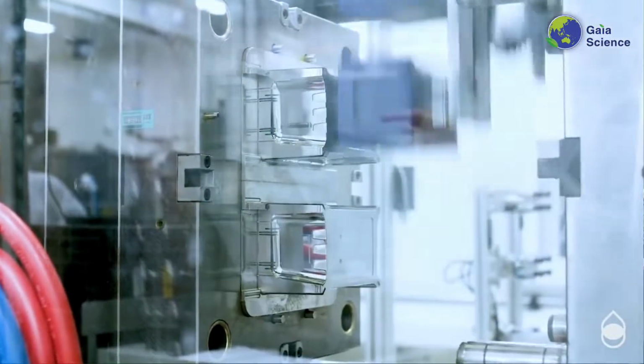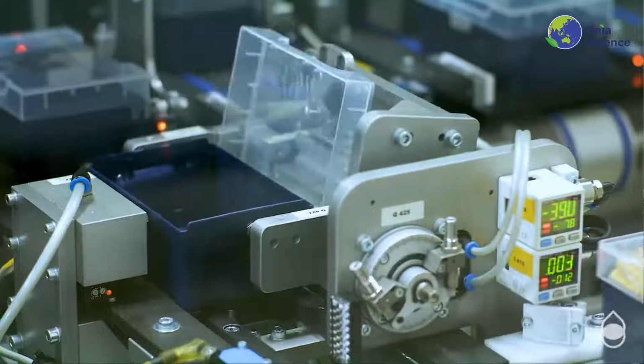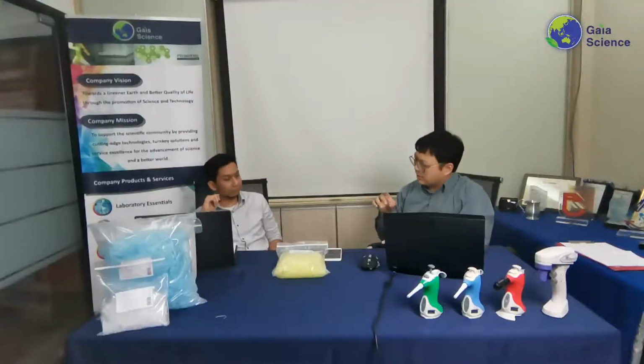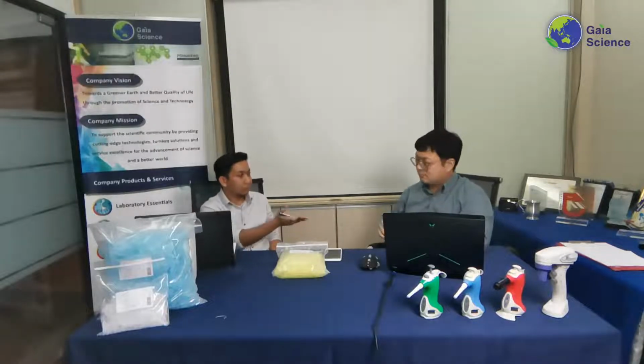Well, I would say that buying bulk doesn't really compromise the quality, because whether it is bulk or rack, the manufacturers manufacture all of them equally. It's just that one is packed in bulk like this, and one is packed in racks. And it leads to another good question, whether it is sterile or not sterile. Out there, they also have bulk and rack, and there are comparisons between sterile and non-sterile. What do you say about that one?